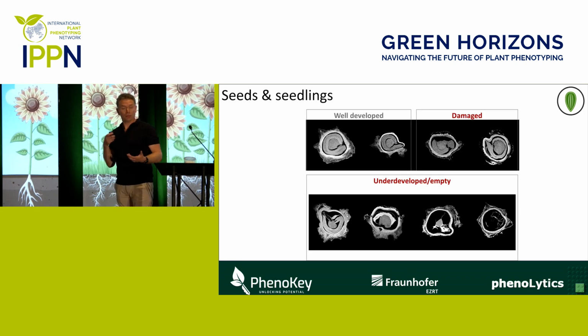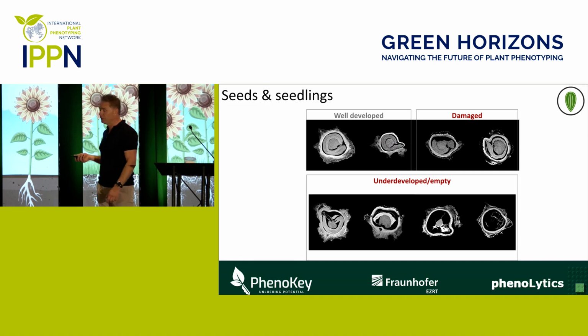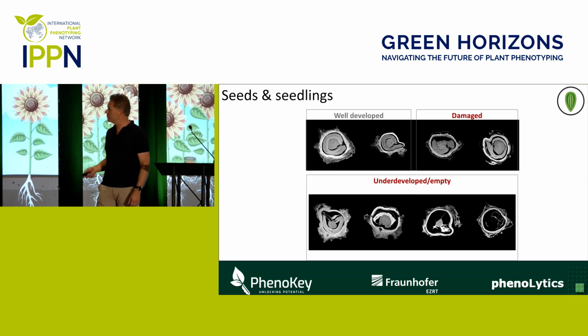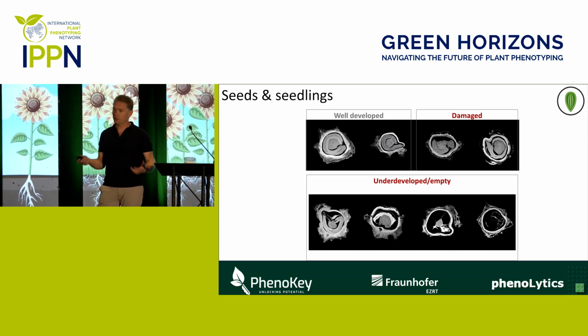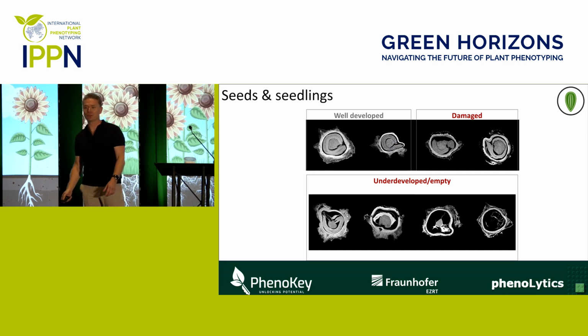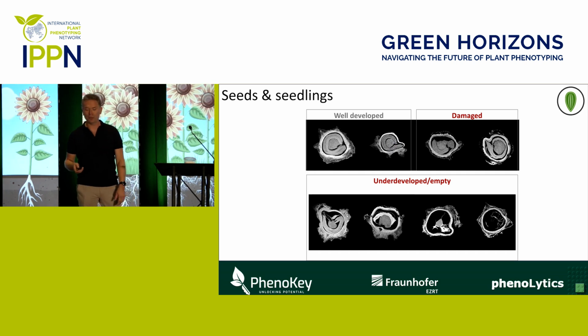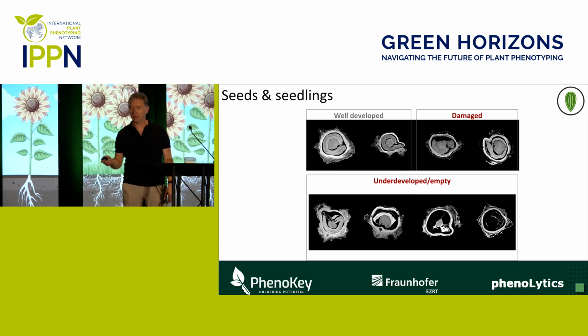And when you do the scanning and collect information, with that information you can also tell something about the quality of the seed. So you see well-developed seeds that will generate healthy plants, for instance, and you also see damaged seeds that might not result in healthy plants. But what you can also see is that, for instance, outside shape or volume of the seeds is not directly dictating whether or not the seed is healthy. On the top left, the 2 seeds are both healthy, but one is much smaller than the other, but both show a well-developed embryo, which probably results in a healthy plant.